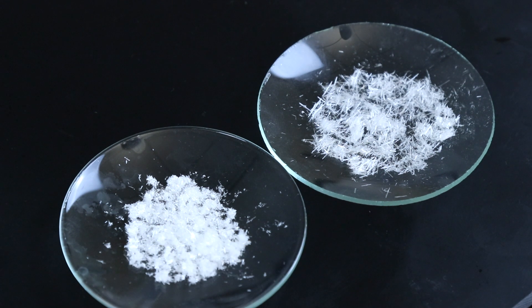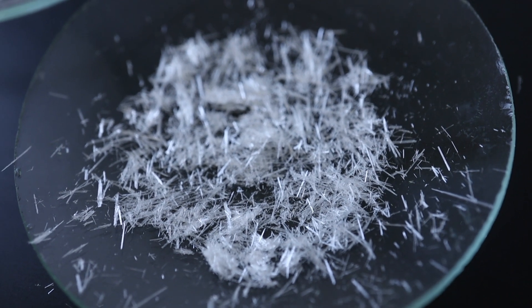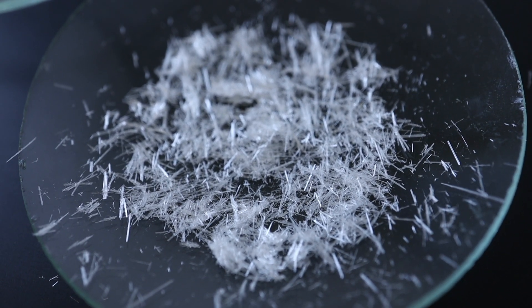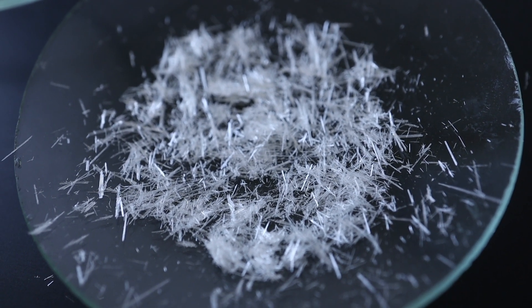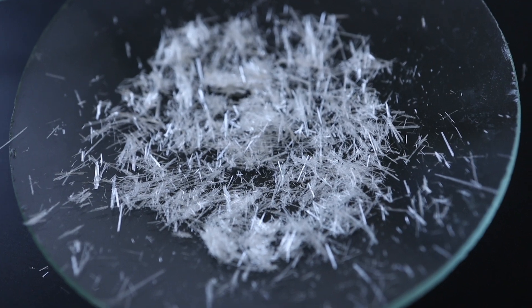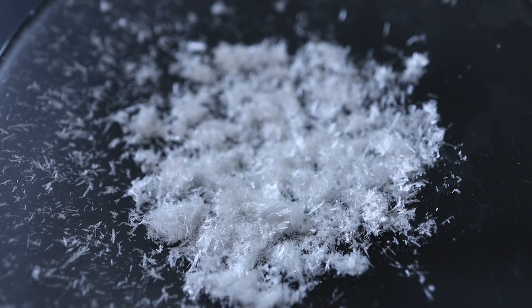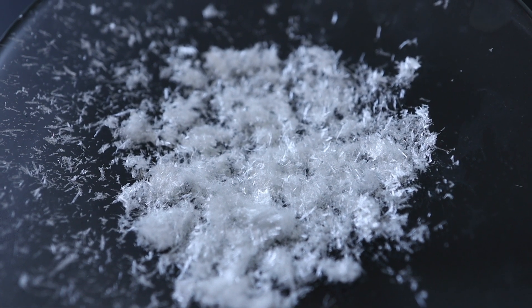Here are two examples of what that product might look like after recrystallization. On the right side you can see much larger crystals, which is a good sign that they're pure, but larger crystals will take longer to melt and require more energy, so you'll usually end up with a wider melting point range that isn't as tight. Smaller crystals will usually offer a tighter melting point range unless there are impurities that affect the melting point.